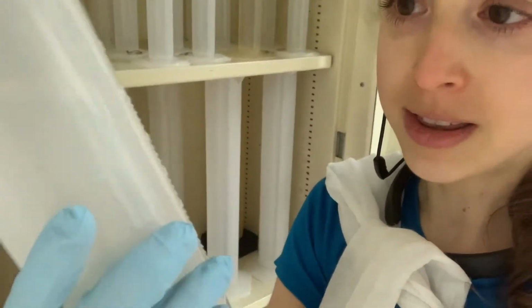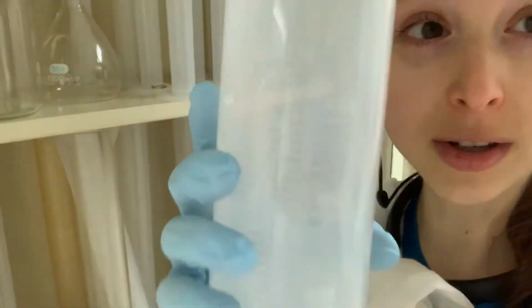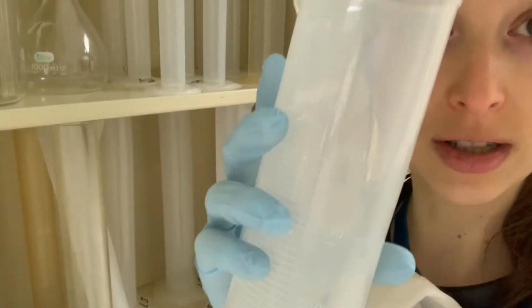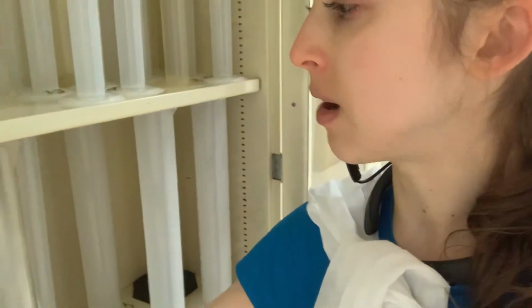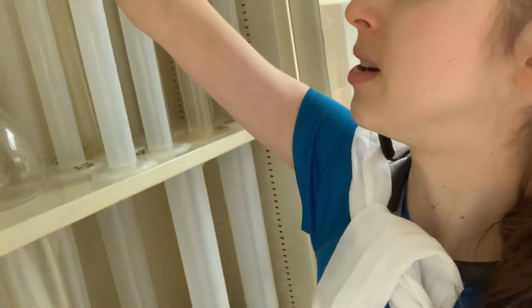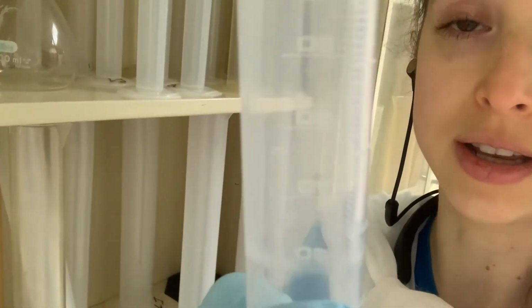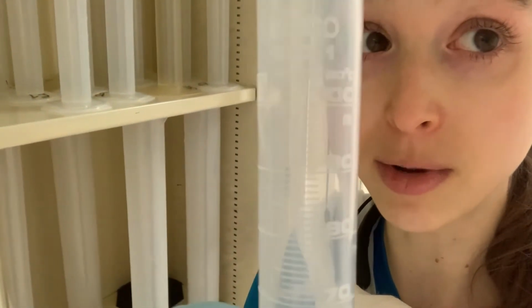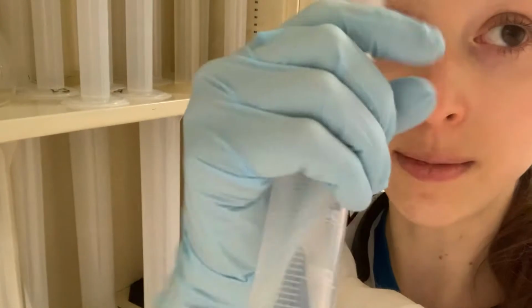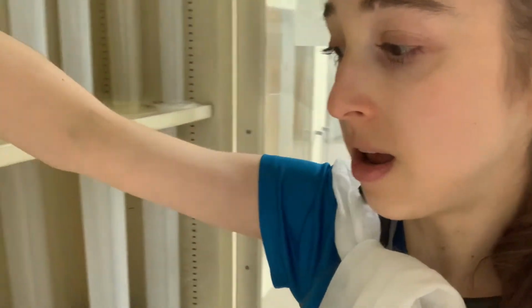And so with these lines, you want to use the graduated cylinder closest to the size that you're measuring. Here the lines are 10 apart. I wouldn't want to use a 1 liter one if I had a really small volume, like less than 100, like 100 mils, because here the lines are 1 mil apart, and so I can get better accuracy in my measurements.